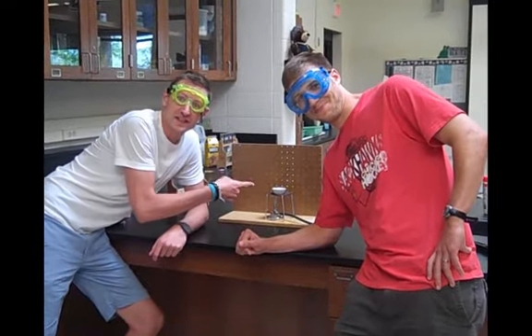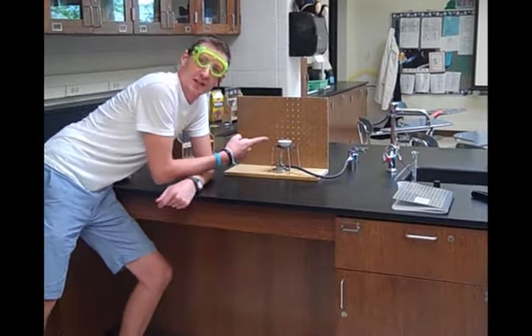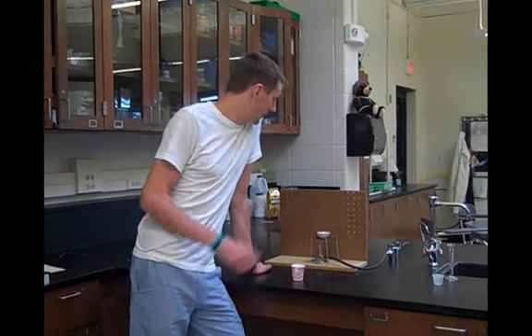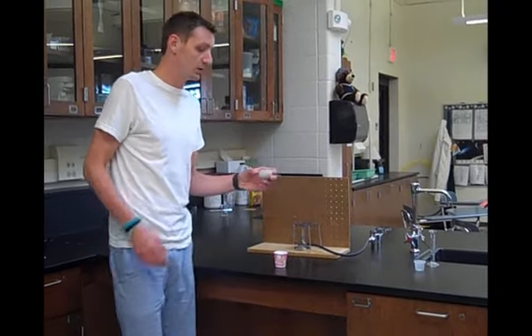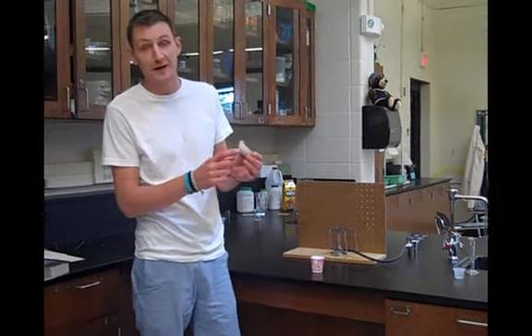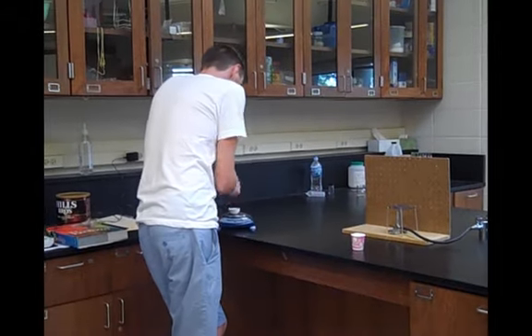As you can see, this thing is smoking, so you gotta let it cool down before you touch it. So now that you have let this cool down, you can now touch it, and what you're gonna want to do is find the mass of your evaporating dish and your solid. So I'm gonna record the mass of my evaporating dish and solid in my notebook. Then you must clean up.